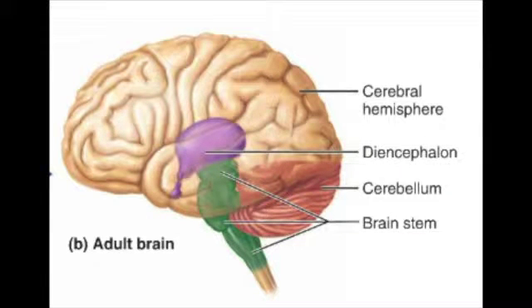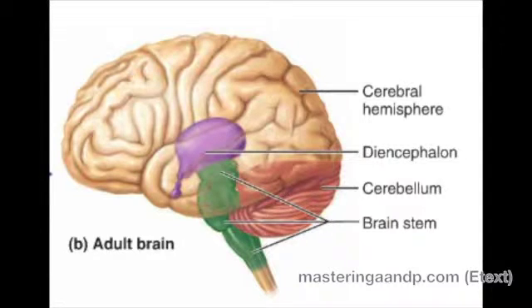This is Sabrina and Jake's sheep brain dissection video. We will be identifying various structures within the brain and describing their function in the nervous system. Before we began dissection, we identified the major surface regions of the brain.